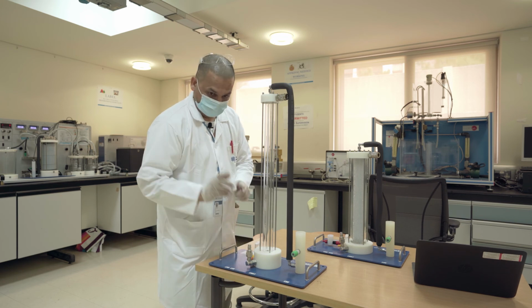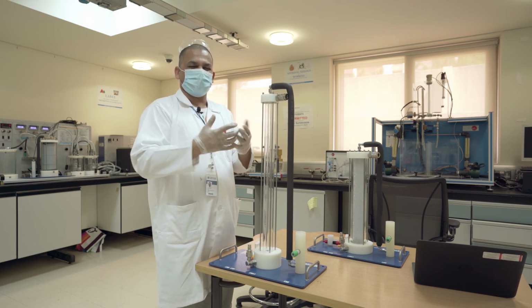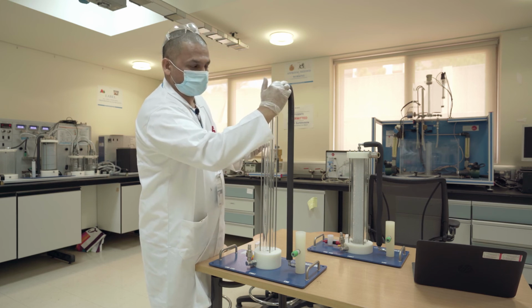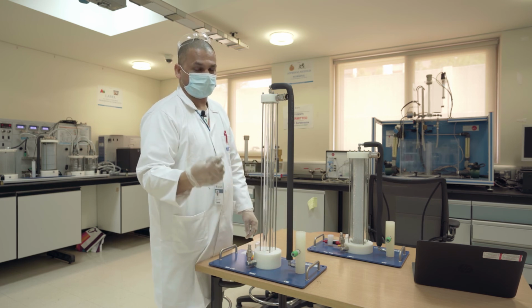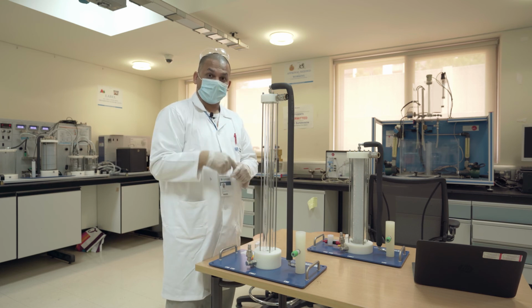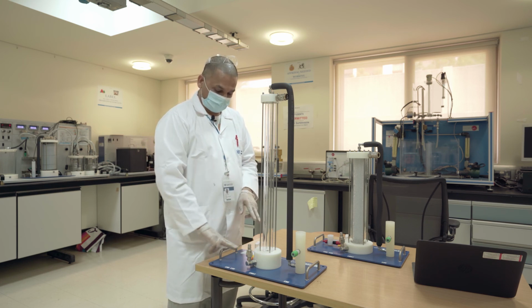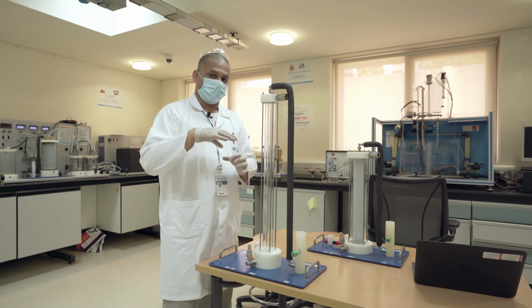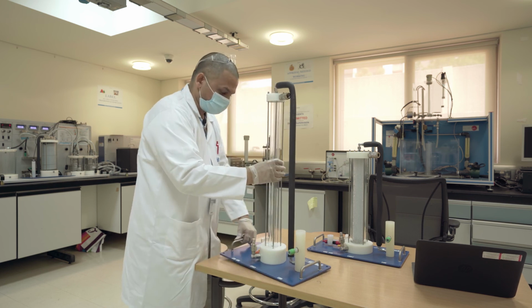What we are doing is allowing both reactants to come into contact here, and then using the laminar flow to maximize the contact between the two to have more reaction. Once they come out, they are in equilibrium, and we are just measuring from here the final conductivity. So if I want equimolar, the same concentration, I can do that one time. Then I want one at a different concentration, maybe an excess, again the same, and wait for that. So the same for the LFR also, I can plan in a way that I can do the entire set of experiments here itself. So this was our LFR.